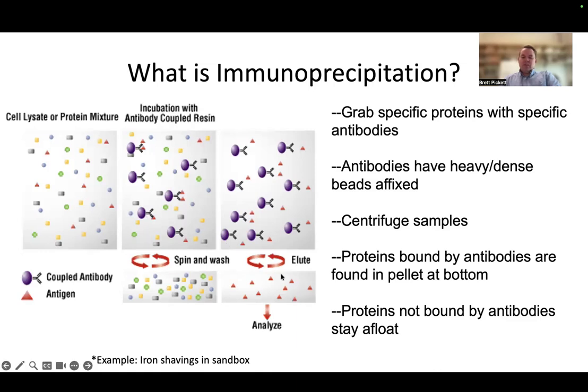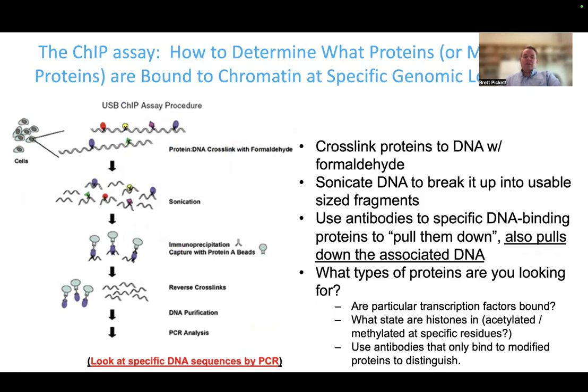Okay, so again, we've got an antibody stuck to a bead, and that antibody is going to recognize a protein. Now, like we said, we want to apply this immunoprecipitation to find specific proteins that are stuck to particular regions on DNA. So we're just going to add on one more step. Rather than start here where the bead attached to the antibody is sticking to the protein, we're going to back up a little bit and say that now, instead of red triangles, our antibody is specific to purple ovals.